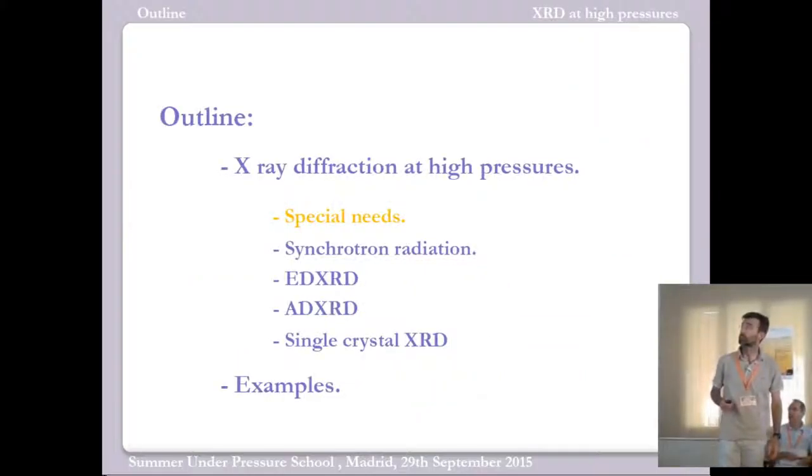So, I'm going to speak mainly about X-ray diffraction, about the technique, and at the end, depending on time, I'm going to give you some examples.